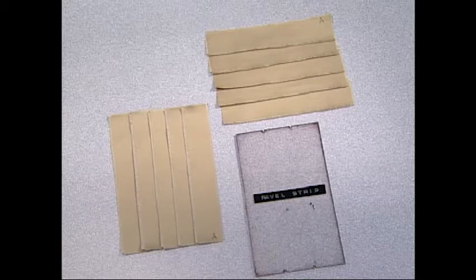Both specimen strips are cut on grain. In the ravel strip, the yarns on both long sides are raveled to a specific width. The cut strip is cut to the exact testing width.